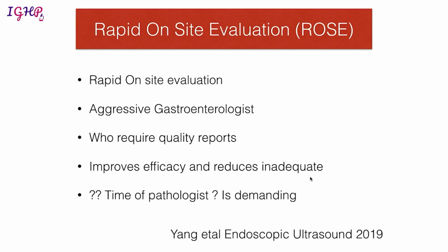So suppose the clinician has visualized a lesion in the pancreas and has taken out a sample in which you do not see anything representative of the lesion. Therein you can tell that the sample is inadequate and we need some more passes, before saying that this is inconclusive.